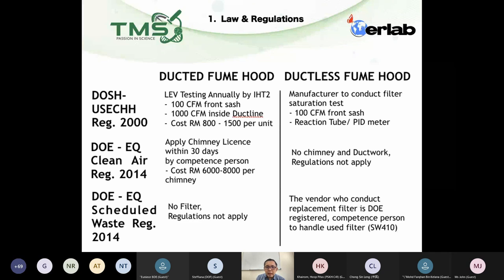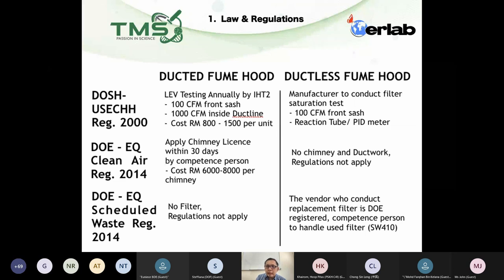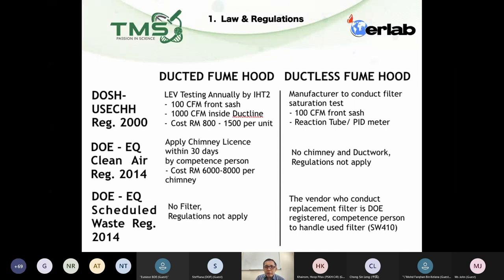On DOE regulations: the first is the Clean Air Regulation, which governs the chimney licence. When you install a ducted fume hood, within the first 30 days you must submit your application to the DOE, conducted by a DOE competent person. The typical cost is RM 4,000–8,000, and emission tests are also required. For ductless fume hoods, there is no chimney and no discharge of chemicals outside the building, so there is no need to comply with the Clean Air Regulation.